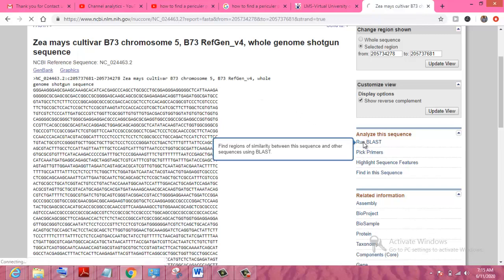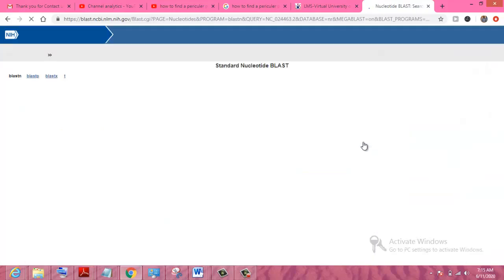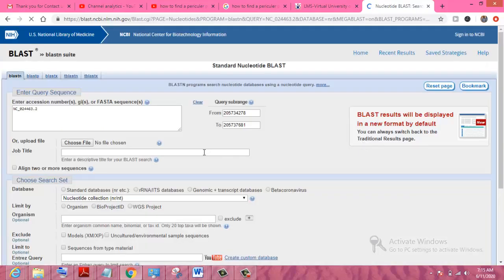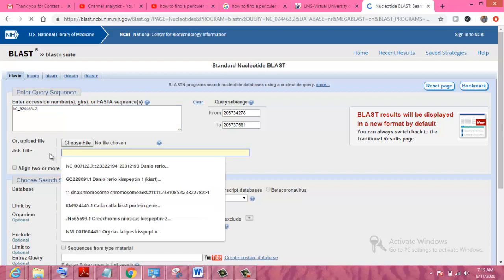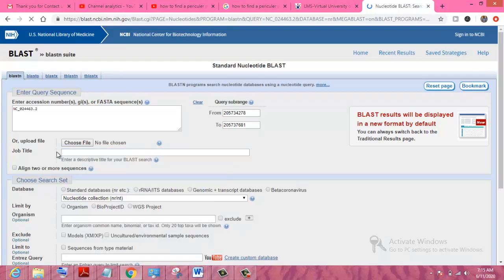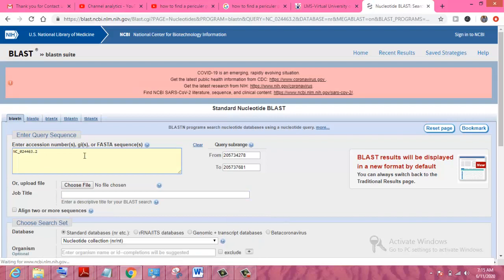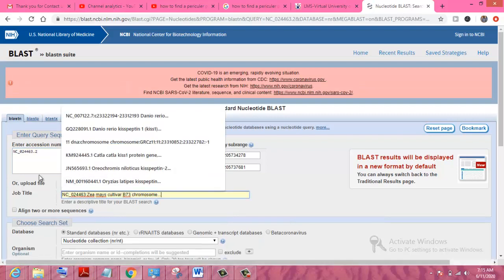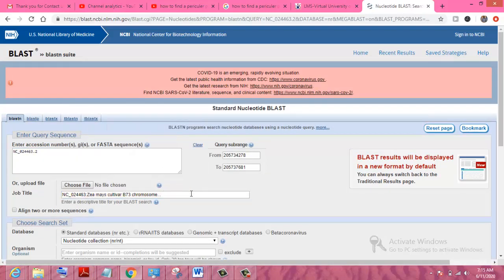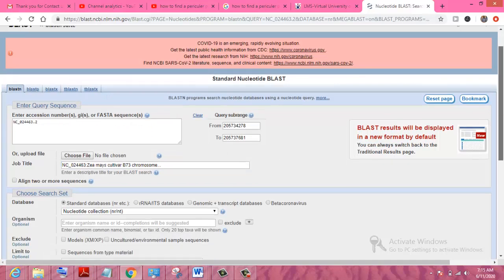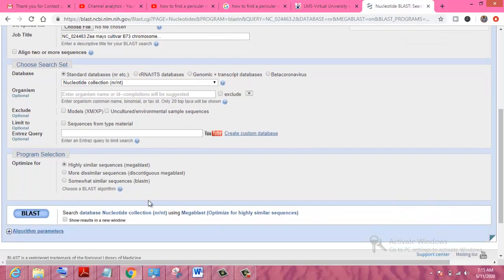We will run BLAST on this sequence to search for similarity. The job will be automatically assigned a session number, and here the job title will appear. We then click 'Next' and proceed to run the BLAST search.